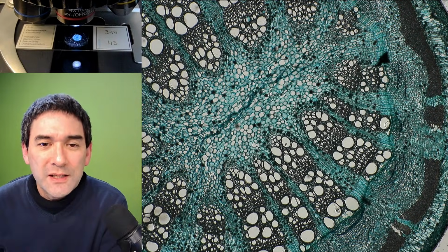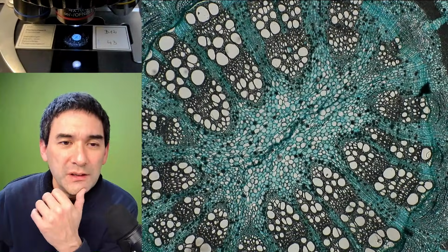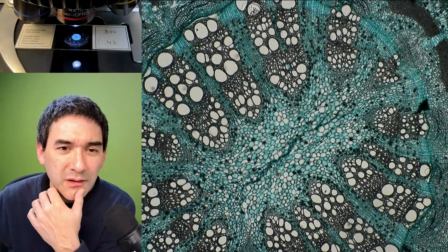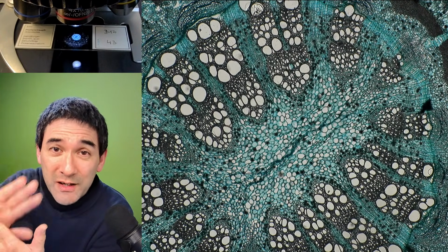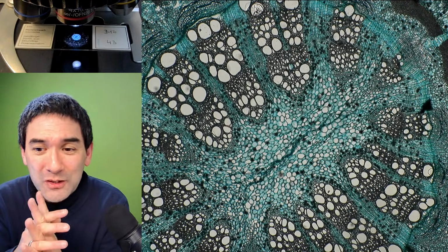Okay, one of the interesting things I have done here, and I should have actually shown you the picture, is I've taken pictures and inverted the colors, so everything that's white becomes black and vice versa, so it's a negative, right? And this almost looked a little bit like dark field. It looks very nice.